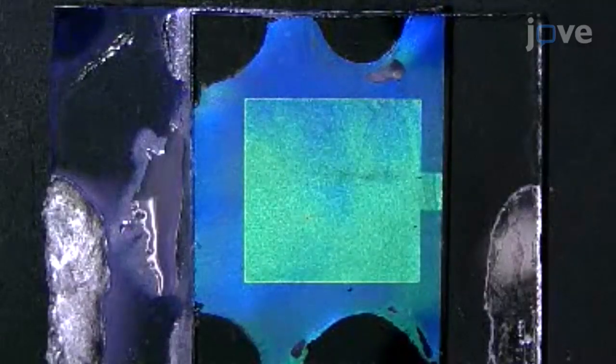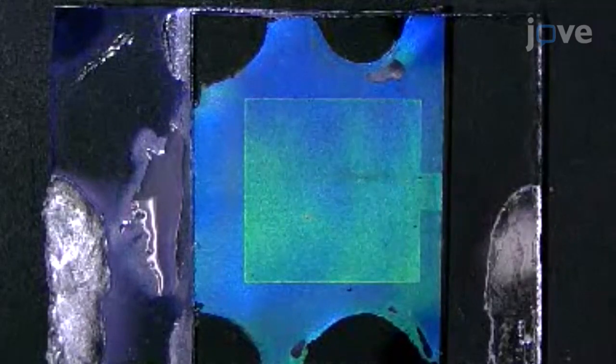Our method enables the fastest color modulation with the lowest operation voltage ever reported for cholesteric liquid crystals. The key is FCD, a chiral dopant with redox-responsive helical twisting power.